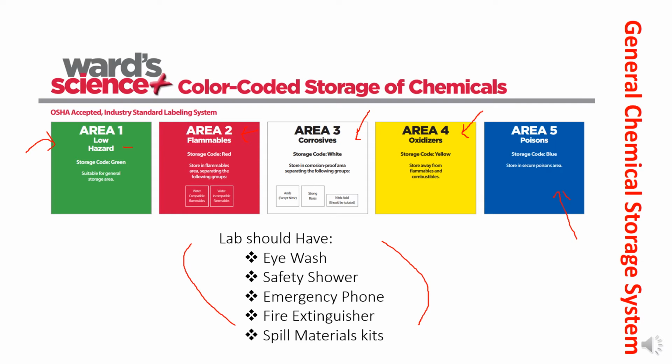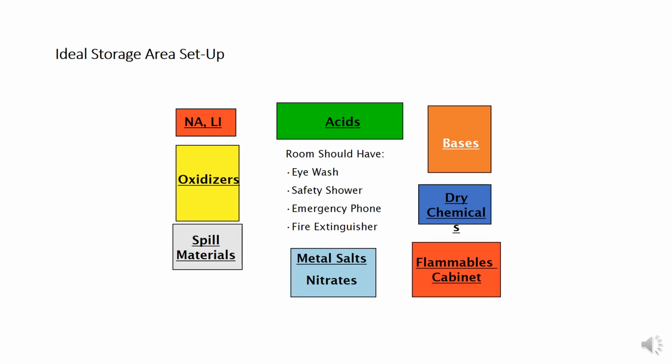So I will remind you of these things off and on, and I add this information because it is really very important if you have a particular storage area in the lab. In this slide you can see the ideal setup for the storage of different chemicals.